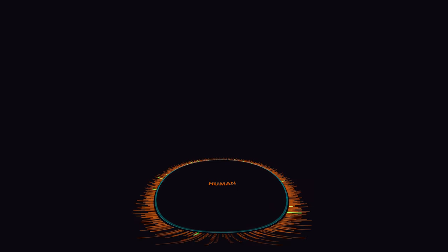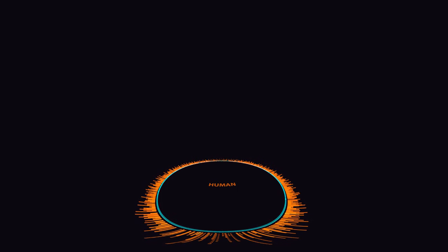What we're now showing is the process of taking the cluster of genes that we've known to be interesting in flies, and mapping them onto the relevant human genome. The browser, if it were dynamic, would be loading this data from HG19 and mapping the appropriate genes to it. In this case, we know that this would have yielded significant research results and steps forward in terms of the management of brain cancer in humans.